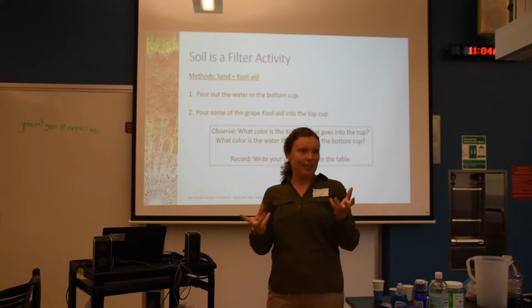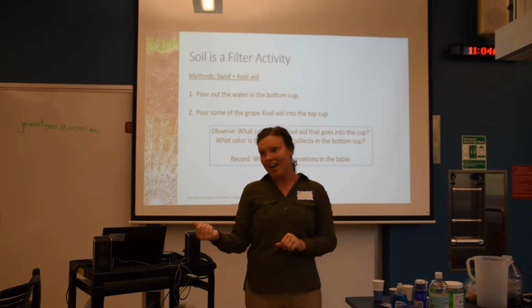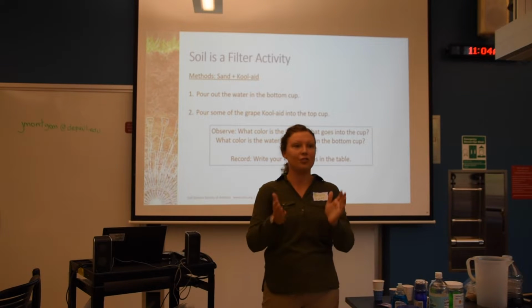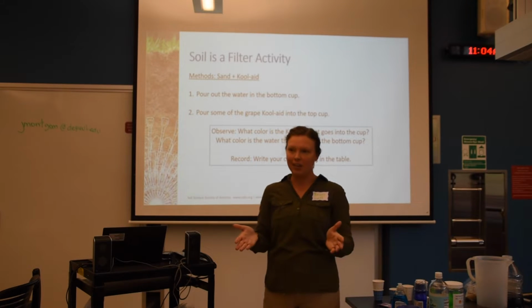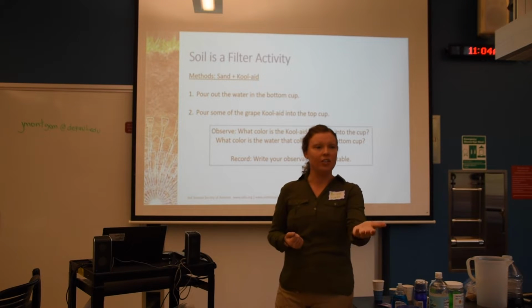So it really is variable depending on how much soil you have, how much of the liquid you add, and if you want to be more precise about all of this to make sure that your results come out exactly as you expect, you might need to do some tinkering with whatever soil you're going to use.